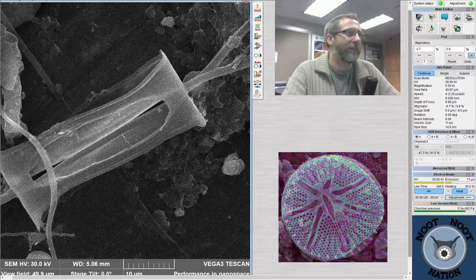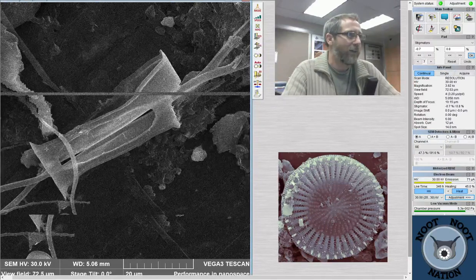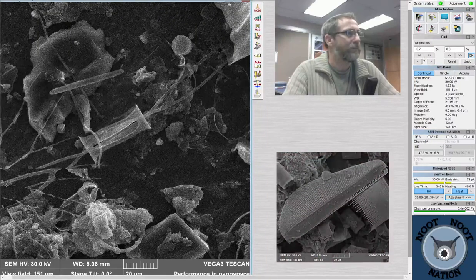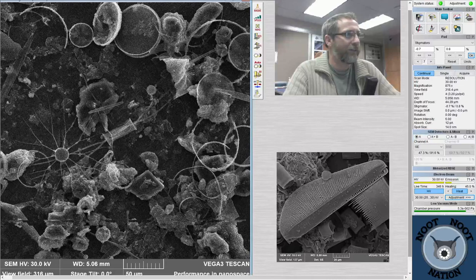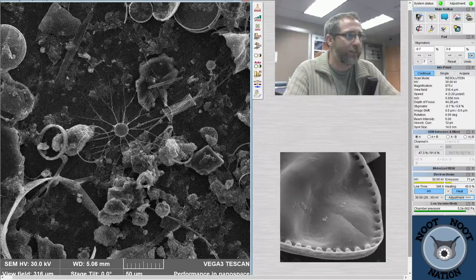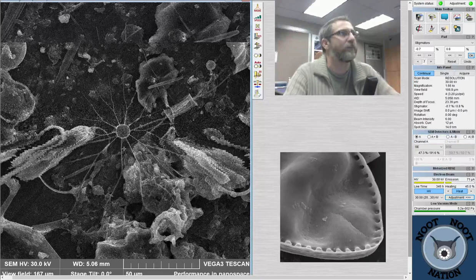It's a Chaetoceros. Those are the setae coming off of it. It just happens to be here on its side. It's one of the long, shallow type of Chaetoceros. I was confused by why it had extra long spines on one side, but those belong to the Chaetoceros, and there's some interference with the Chaetoceros's spines right here, coming into the backside of this Bacteriastrum.